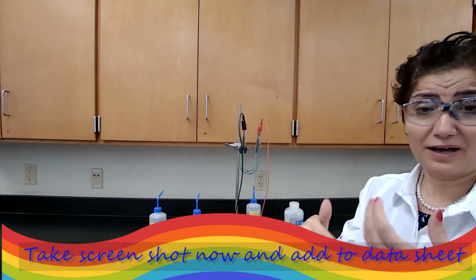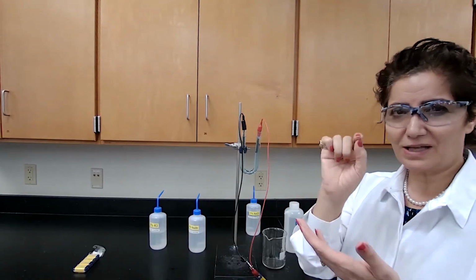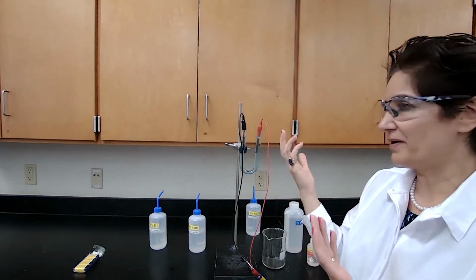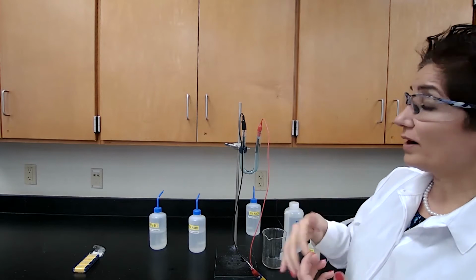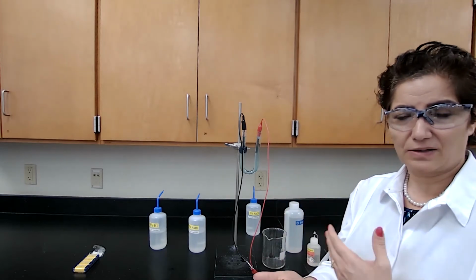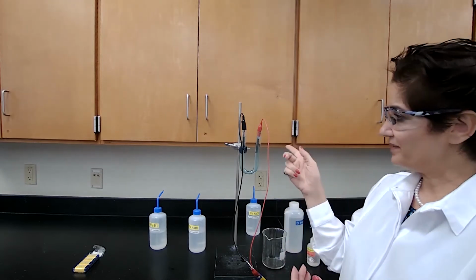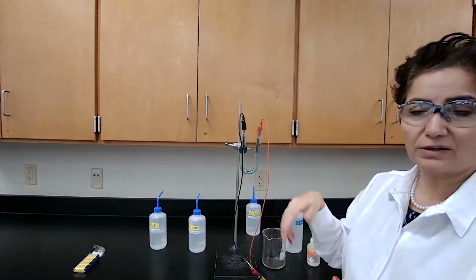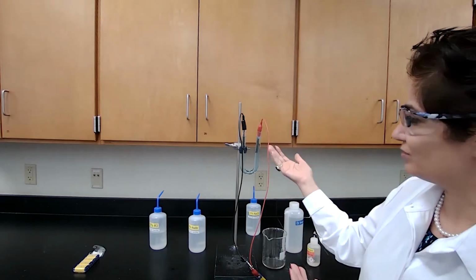So if we give enough time and copper is being reduced, we should see red dots on that electrode, which we have to wait for. The other choice for reduction is water. If water is reduced, we will see the pink color. If you remember from the previous reaction, as soon as I connected to the battery, I started seeing the pink color appear. So it shouldn't take that long for the pink color to appear.